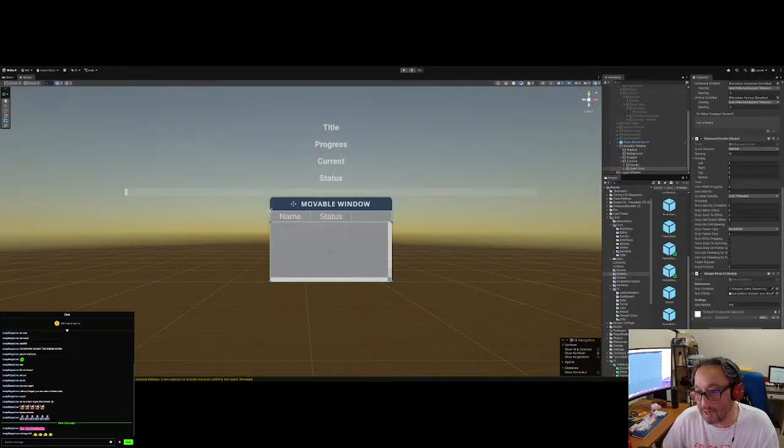If you don't, you don't have to; you delete them if you want to. And then we have some events that we published, that we got the samples and all that. So that's how the sample service is used. The sample panel UI uses the sample service, and then the sample service uses the CRUD service, which is the Hasura whatever service to Supabase, and that's how you pretty much do it.